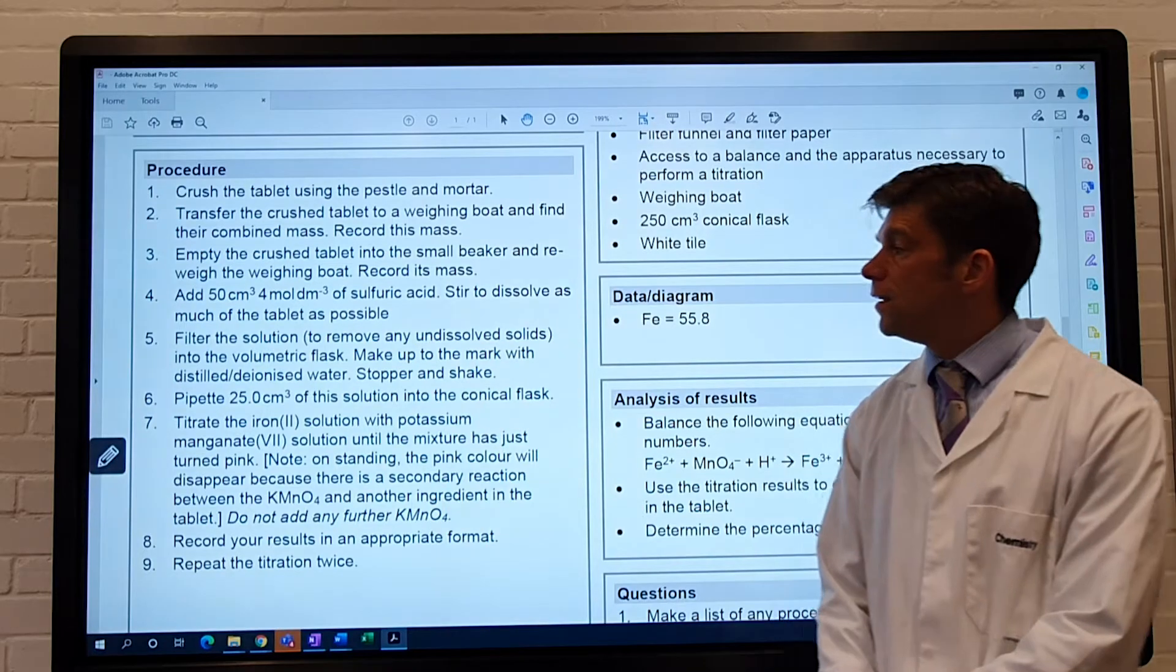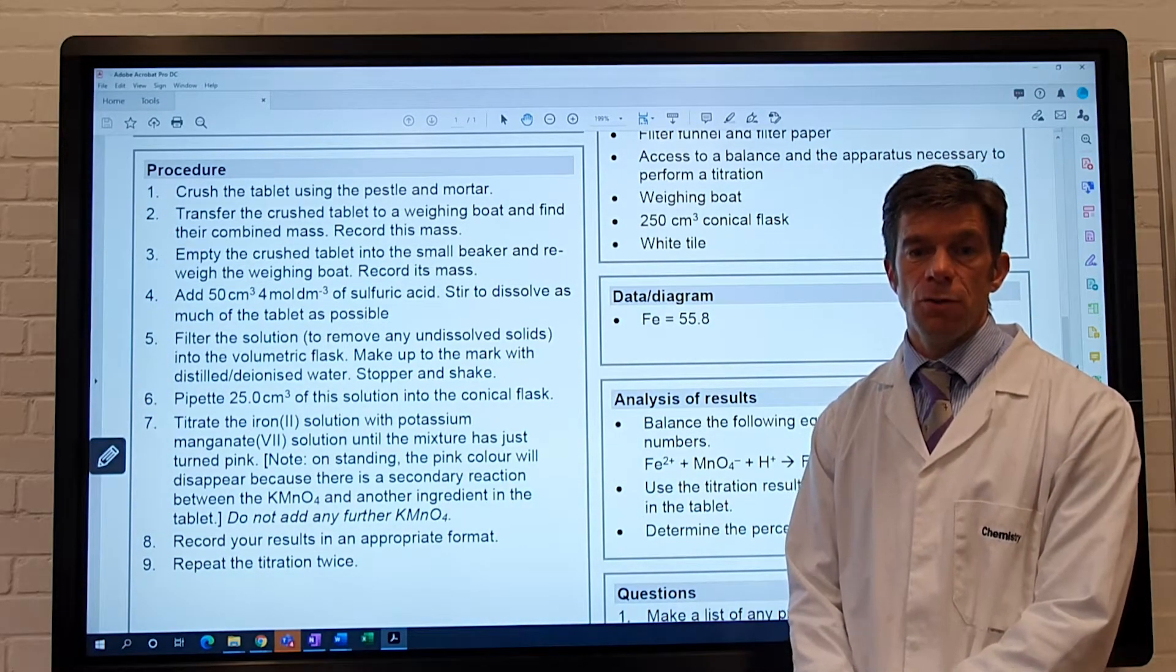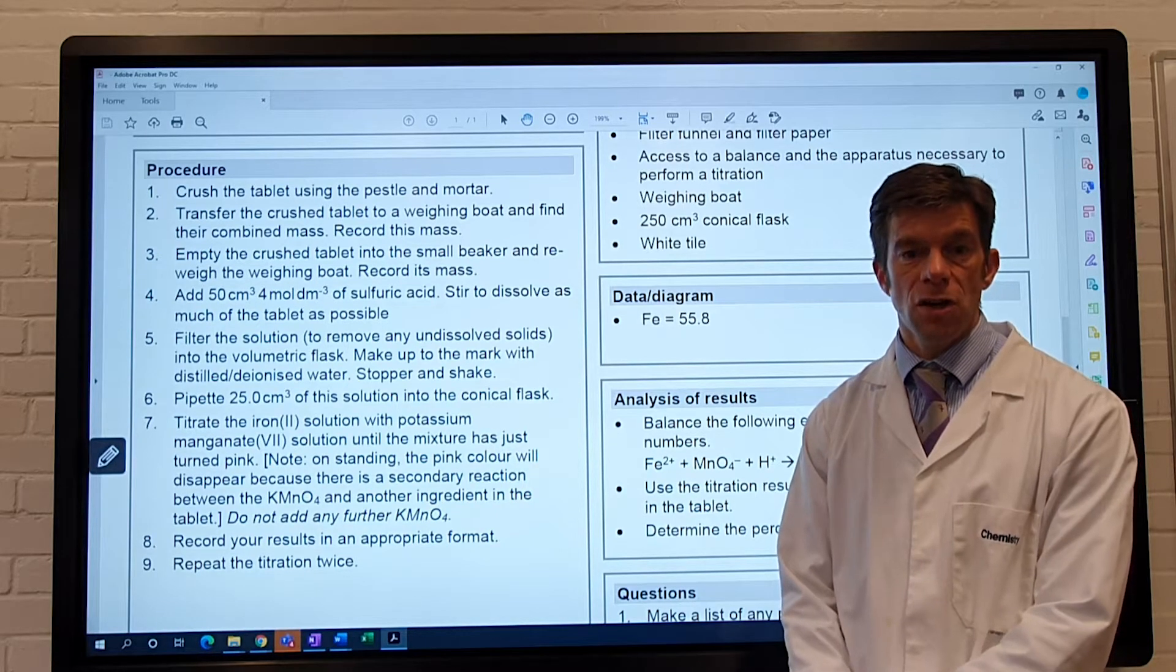Step 7, titrate the iron 2 solution with potassium manganate solution until the mixture has just turned pink.